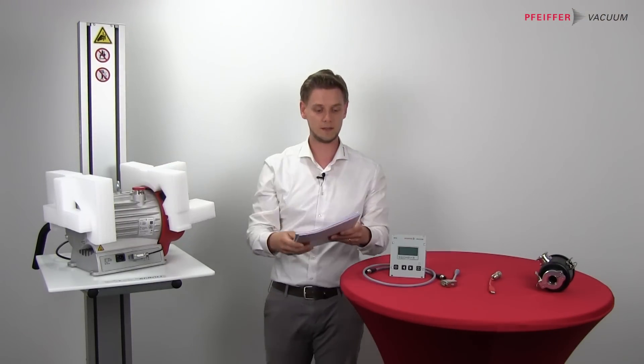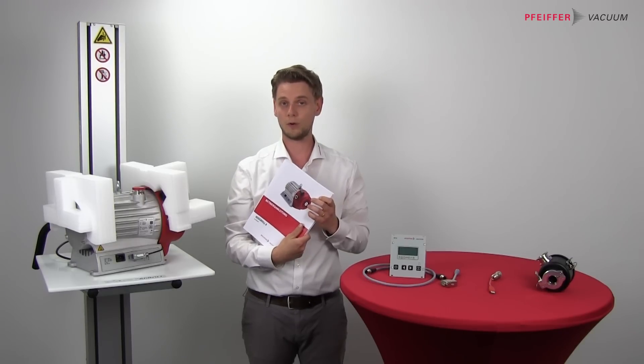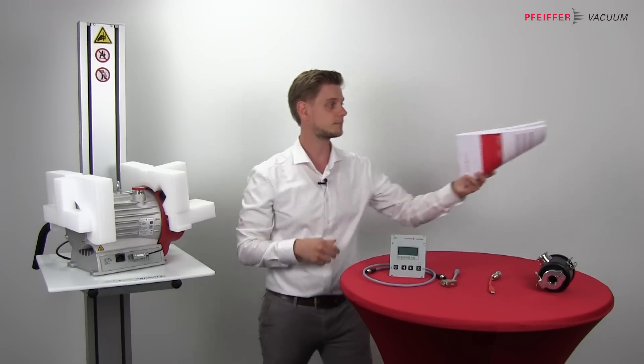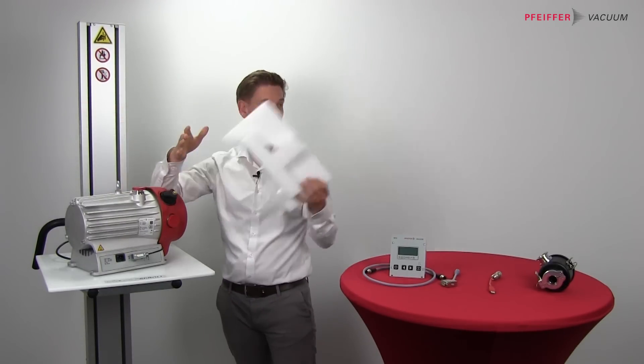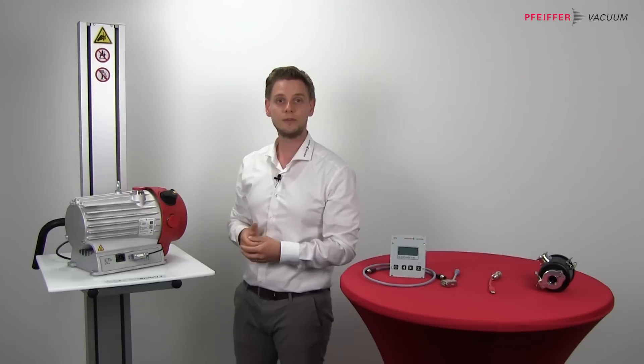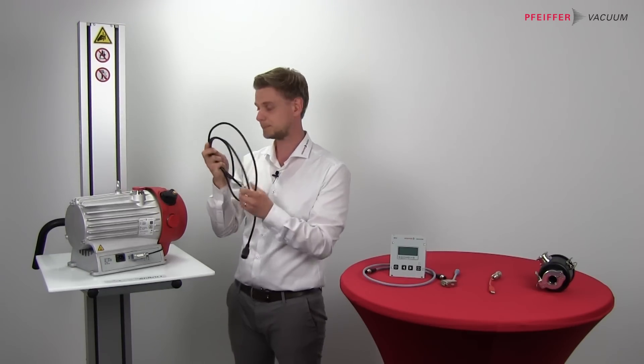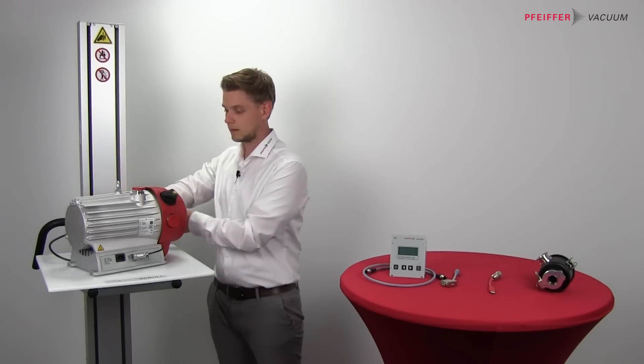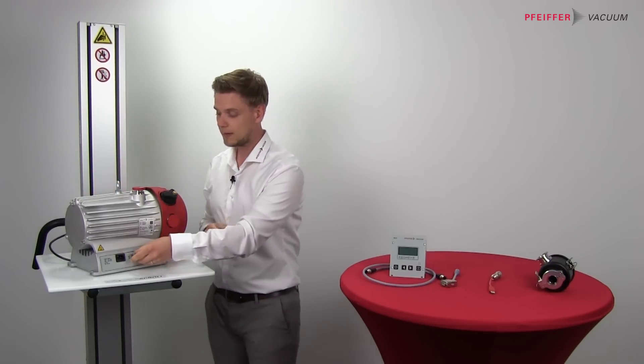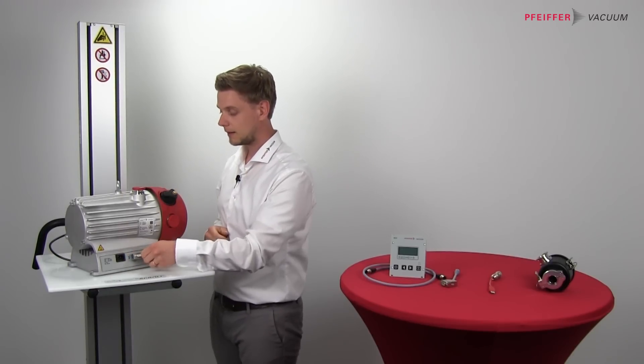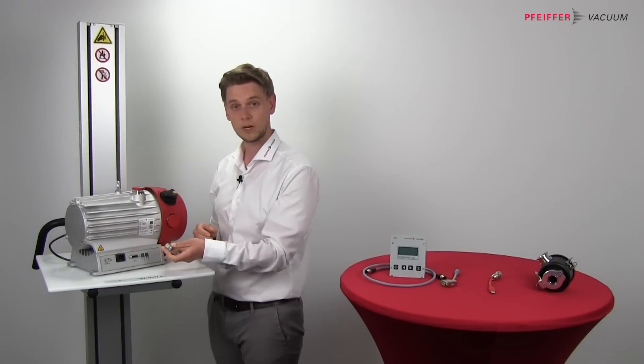First of all you will see the operations manual which is important to read and know how to operate the pump. Some protection and there you will find the HiScroll. Of course there is also a power cable to connect the pump to the power connection as well as the optional RPT-010 which is a special version you can order.